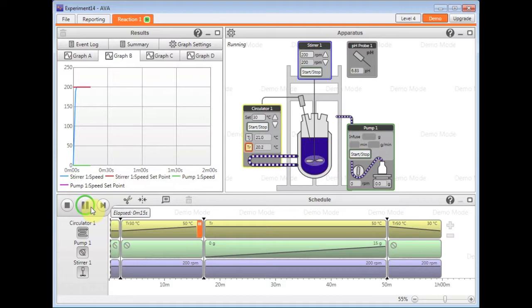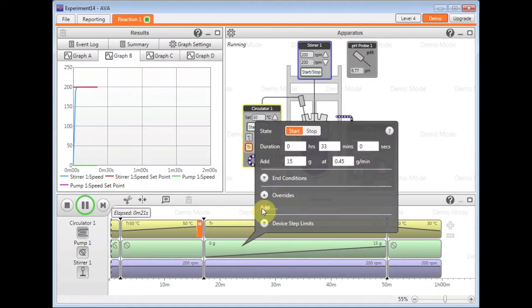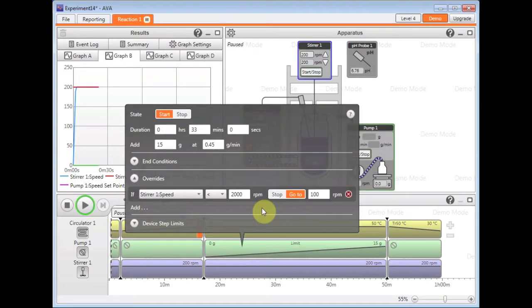I can also add an override or a limit to the addition to say, for example, that if the reaction temperature exceeds 55 degrees, then I want the feed to automatically stop and pause at that moment.